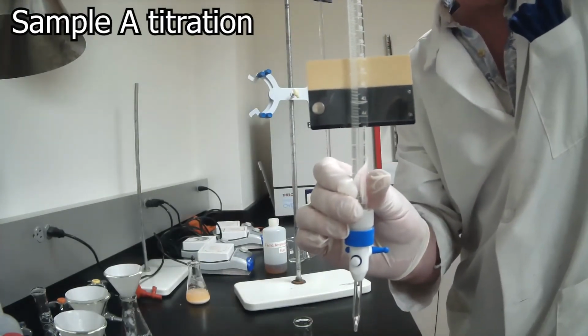You guys see the meniscus we want to read. Remember, the numbers increase going down the burette. Remember, each division mark is worth 1/10 of a milliliter, and you have to be able to record, if it's in between those division marks, the next position in the number.